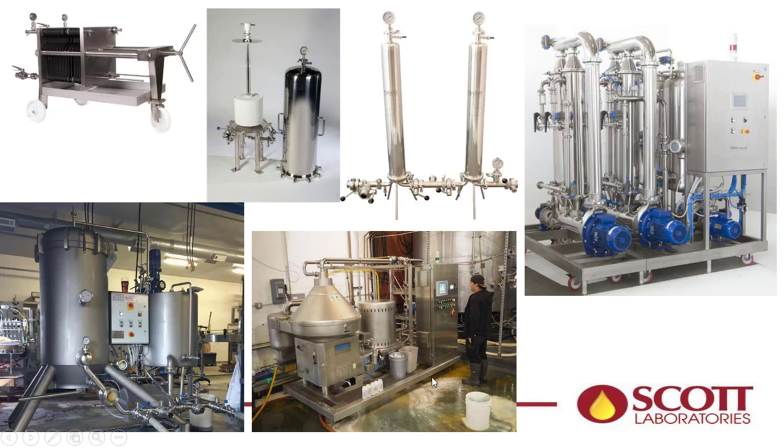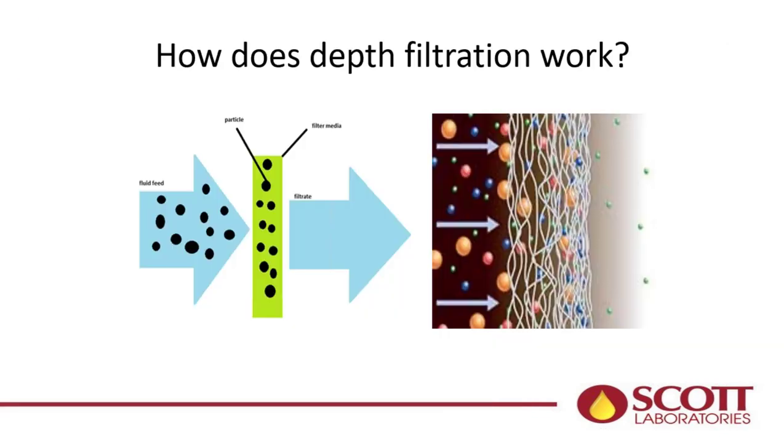These things are fairly easy to run. The problem with centrifuges and crossflow filters is they're fairly expensive. This is easily six figures, as are most crossflows, and that's what this is right here. So it's different tools for different situations. And if you ever want to talk about that, you can talk to myself or Maria Peterson. She's our resident filtration guru.